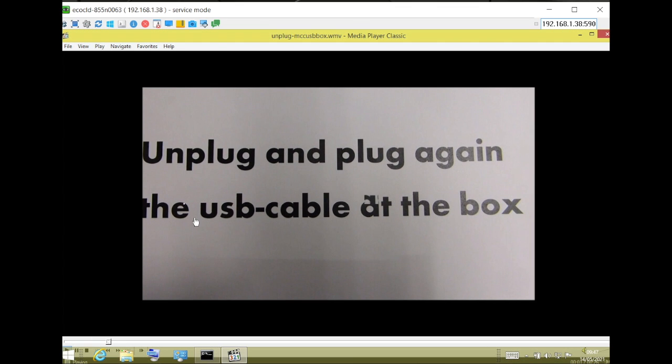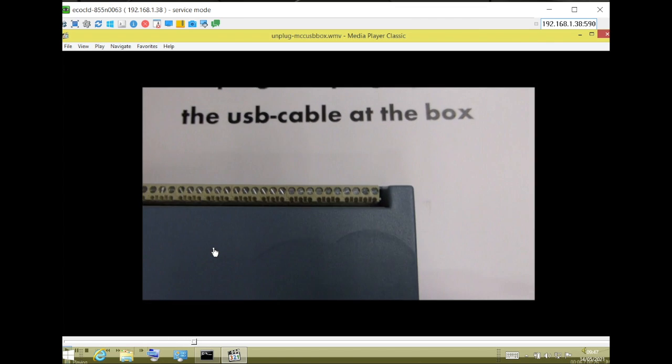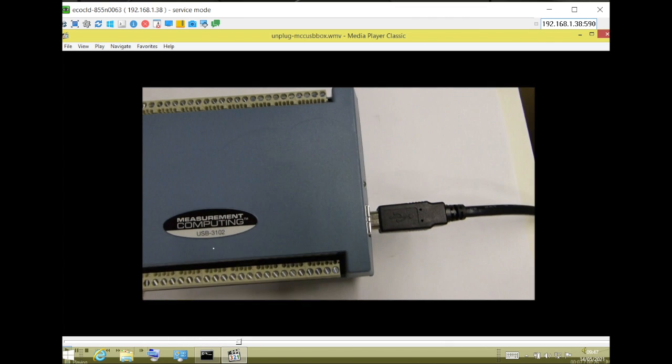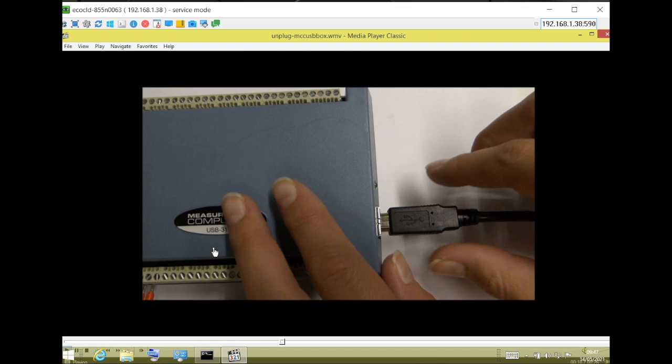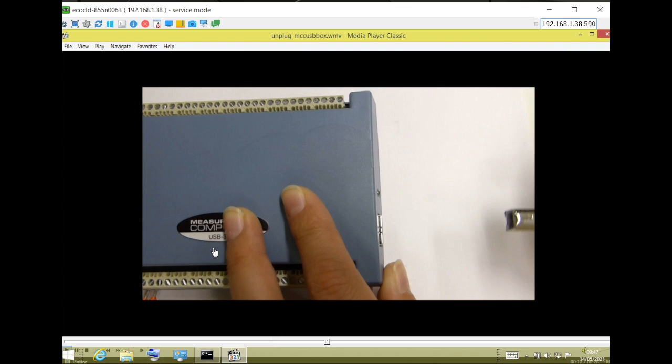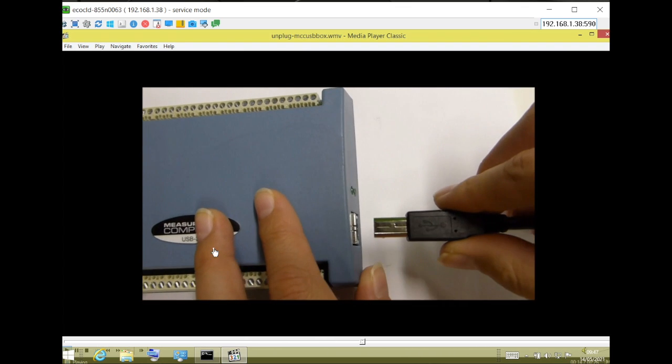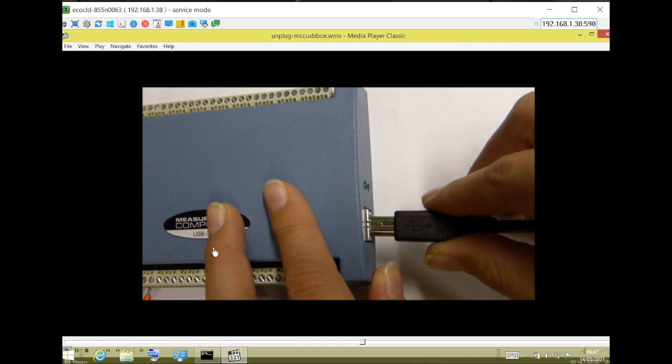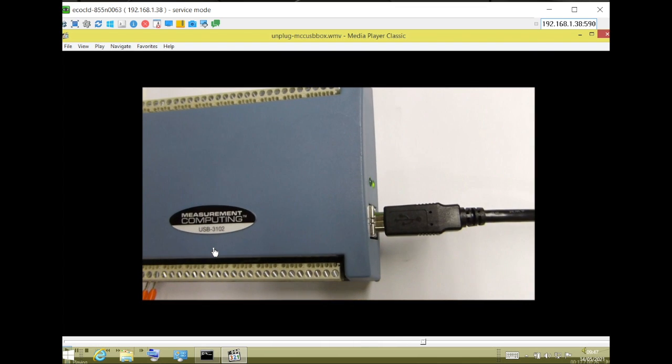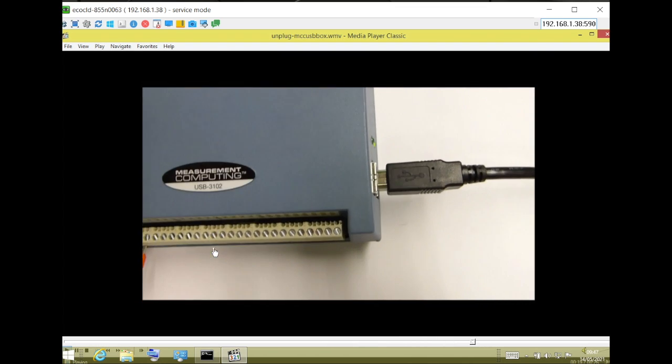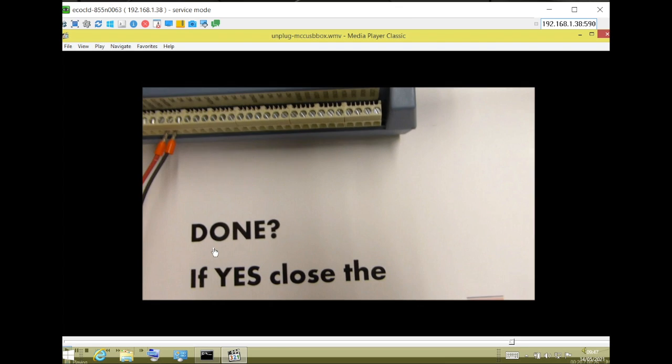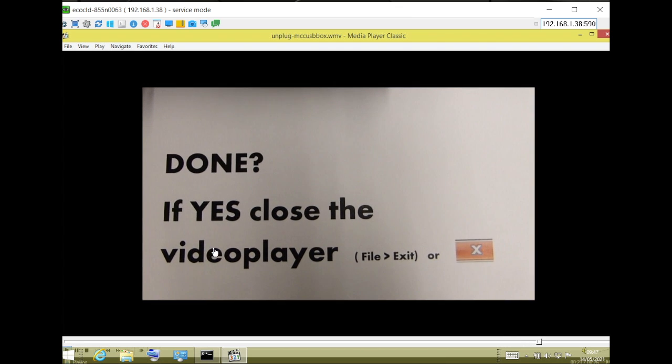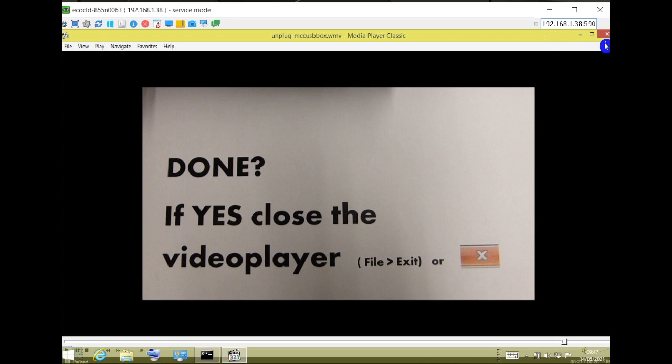A video appears on the NCLD screen instructing you to disconnect and reconnect the USB cable from the USB 3102 box. Follow the instructions on this video and close it by clicking on the X button on the top right corner of the screen.